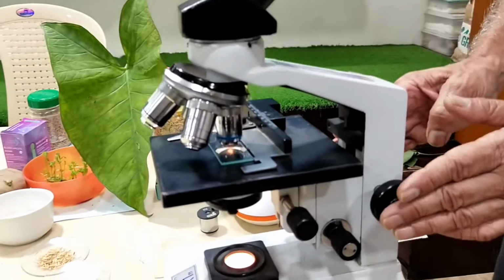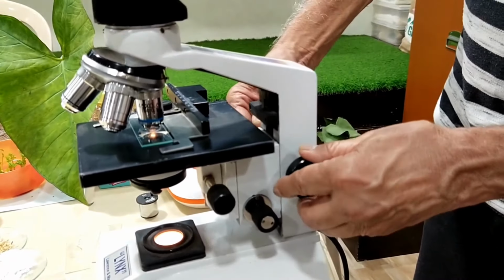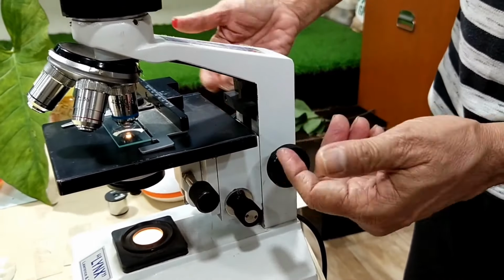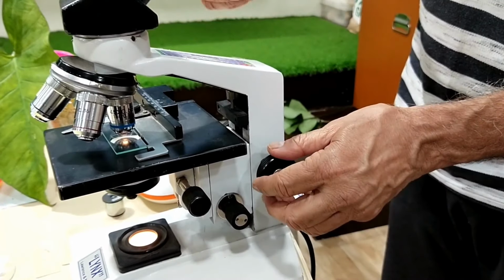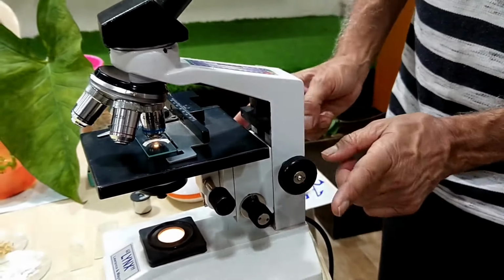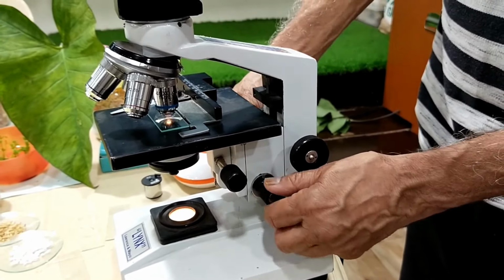There are two important adjustments. This is called the coarse adjustment. The coarse adjustment is for a rough adjustment, for bringing the object in focus. But if you want to make the final adjustment, you have to use another screw, this one, which is called the fine adjustment.